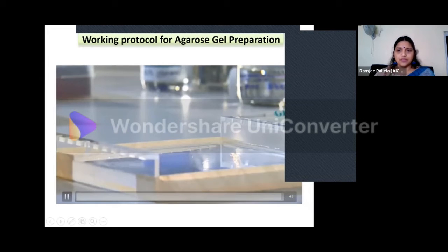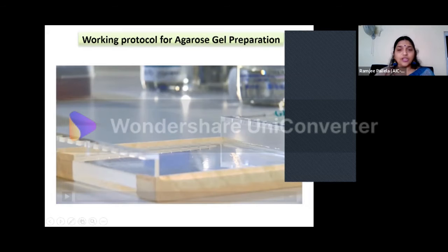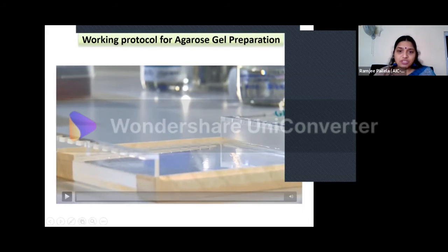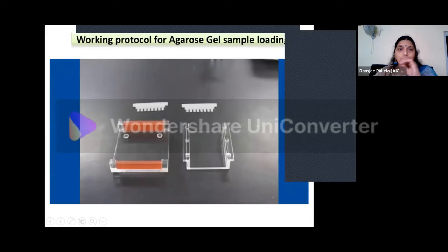So all this happens. Then remove the masking tape from the ends of the gel tray. And now your gel is actually set. Now you remove your gel. Don't leave your gel tray together with the masking tape in the buffer solution, because it will never run, because it is having agarose gel. So now we will see how we are loading the samples into this agarose gel.